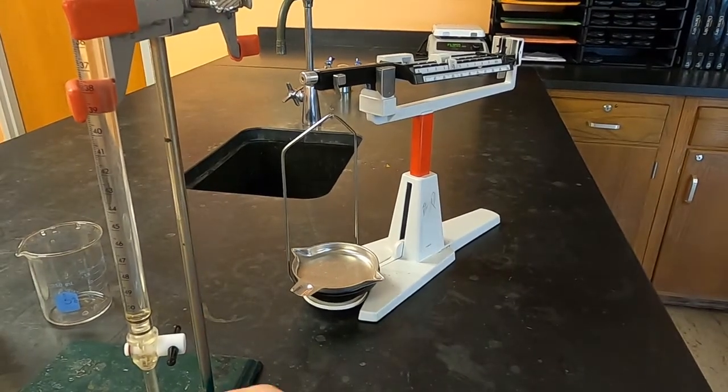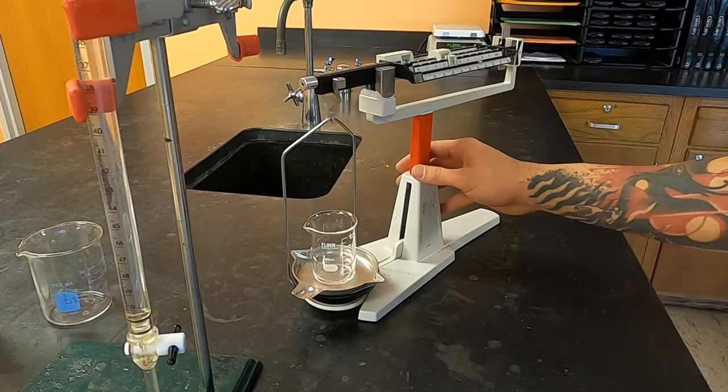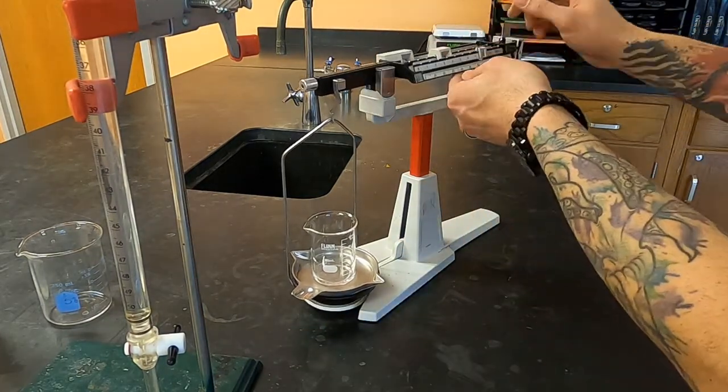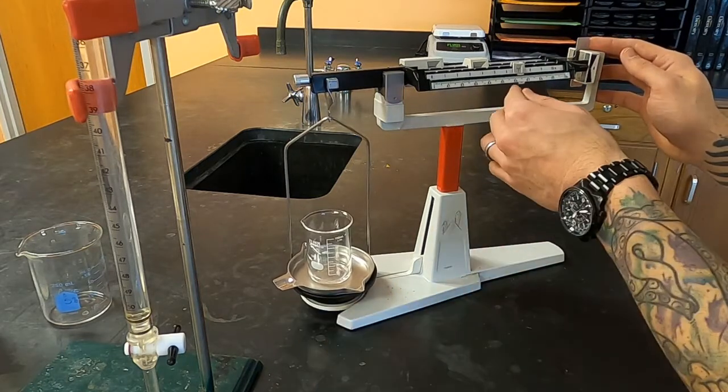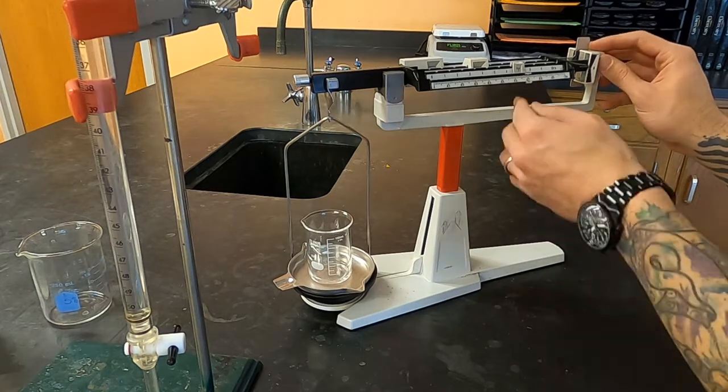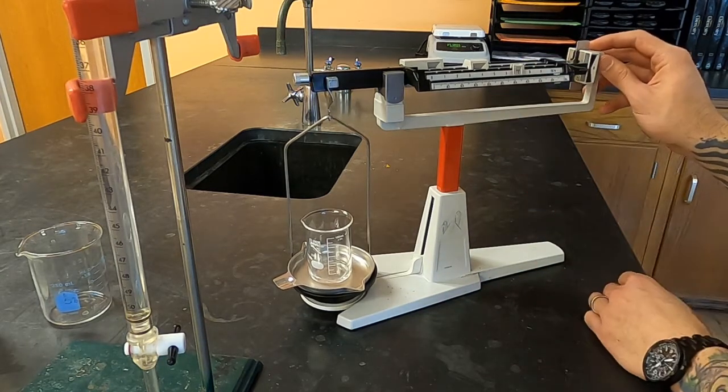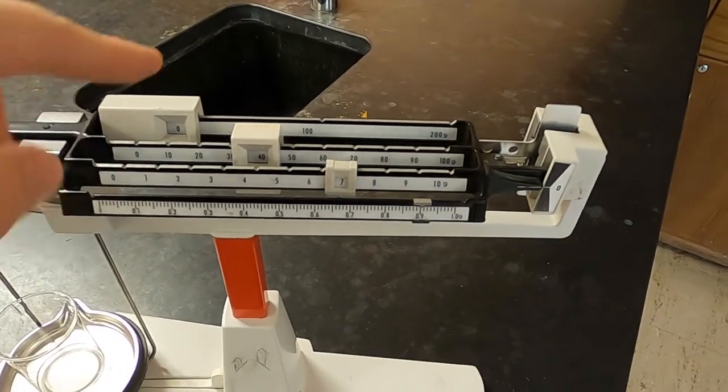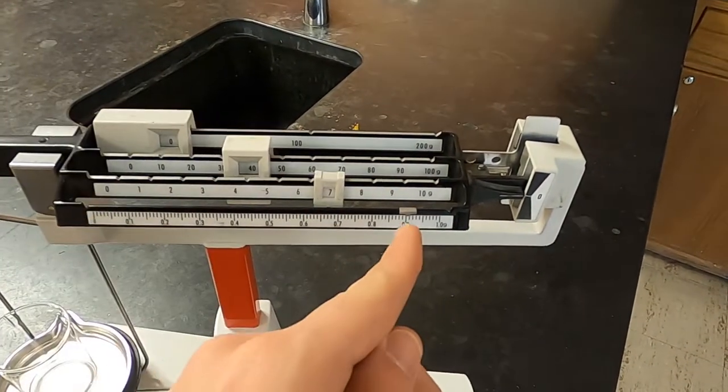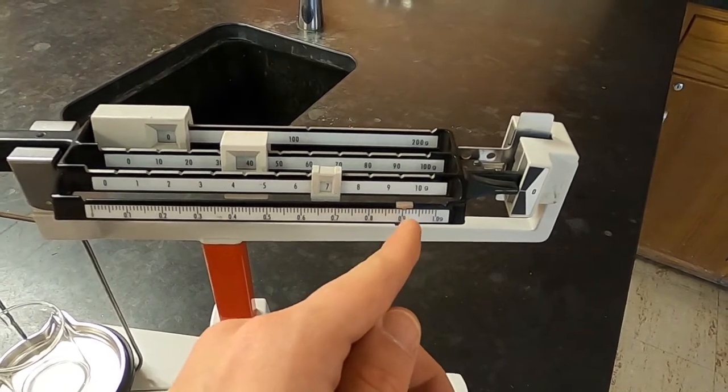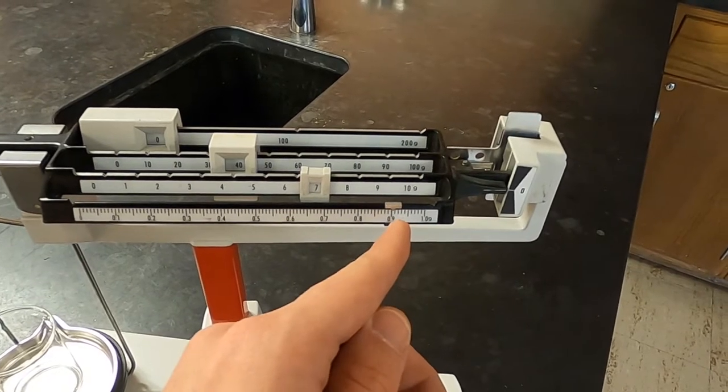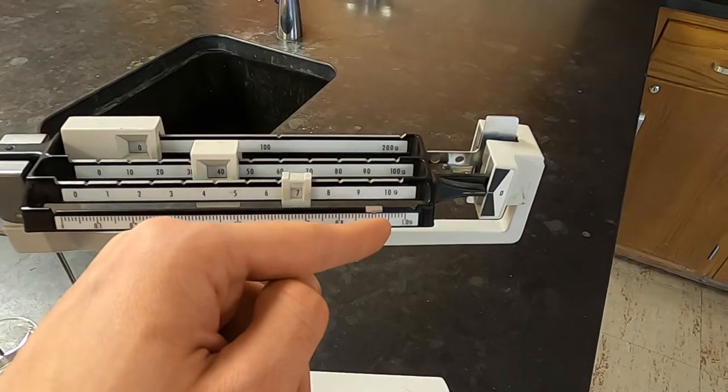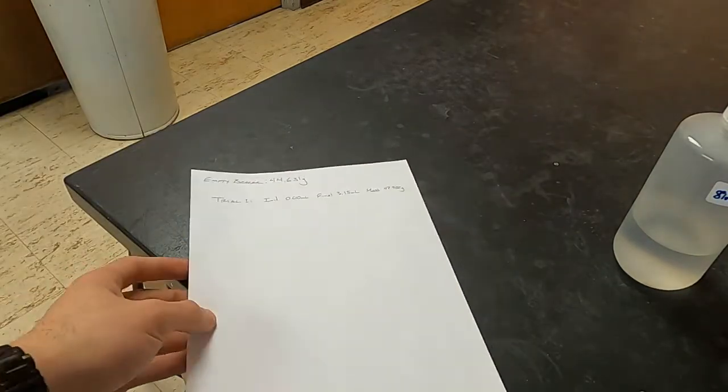The next step is going to be to weigh this beaker with the salt water in it. Now you can see the mass is 47.9 and it's not quite to the 0.91 so I'm going to estimate that it's maybe two tenths of the way there so I'm going to say it's 47.902. So these are my data for trial one. I'm going to perform four extra trials.